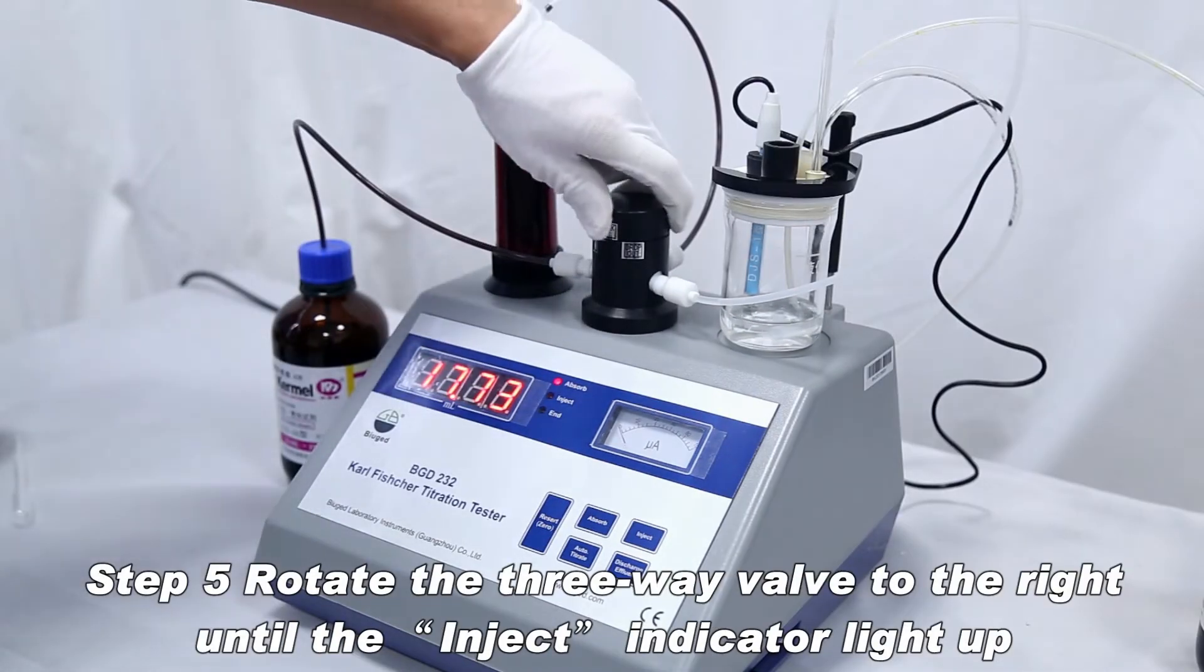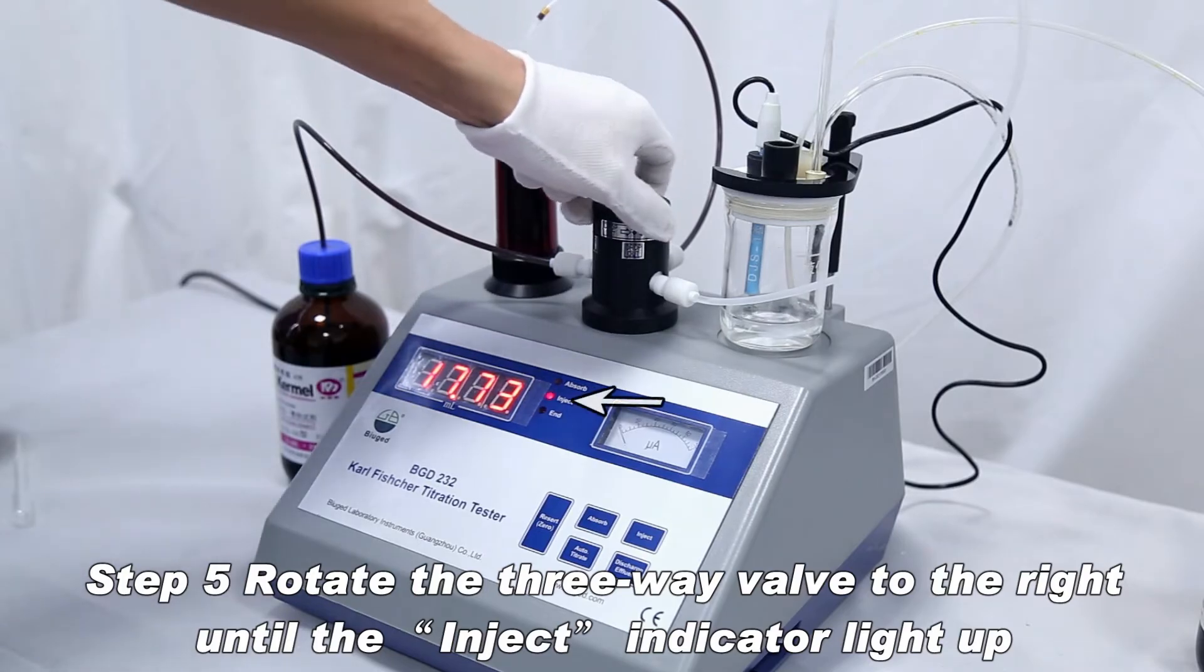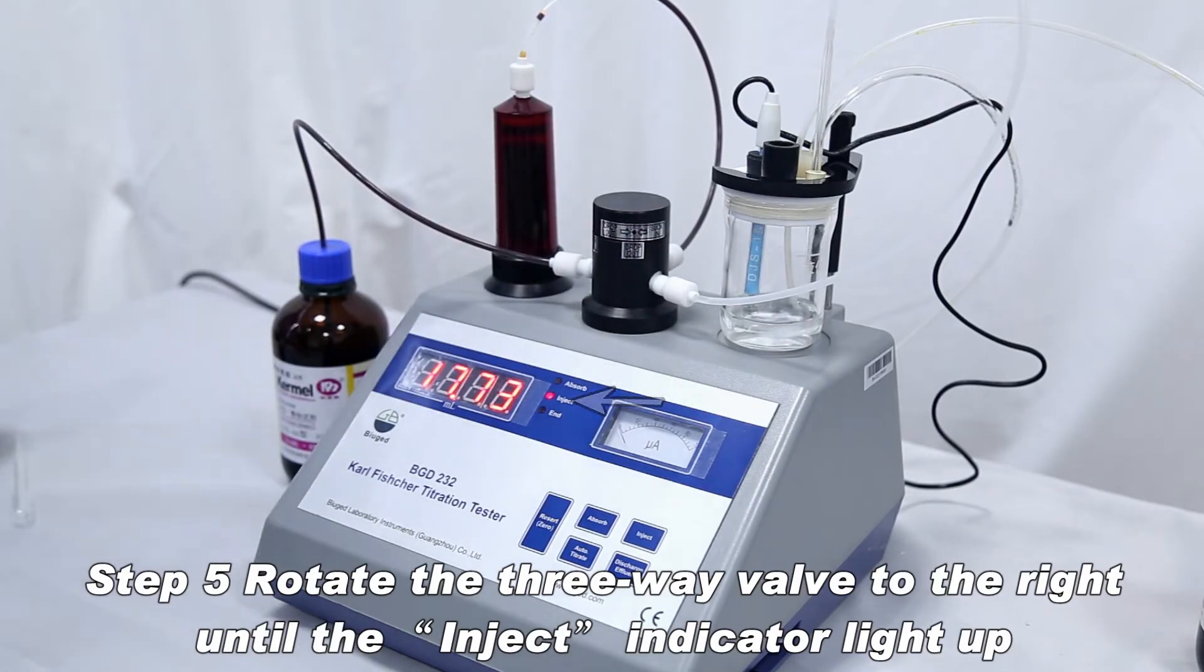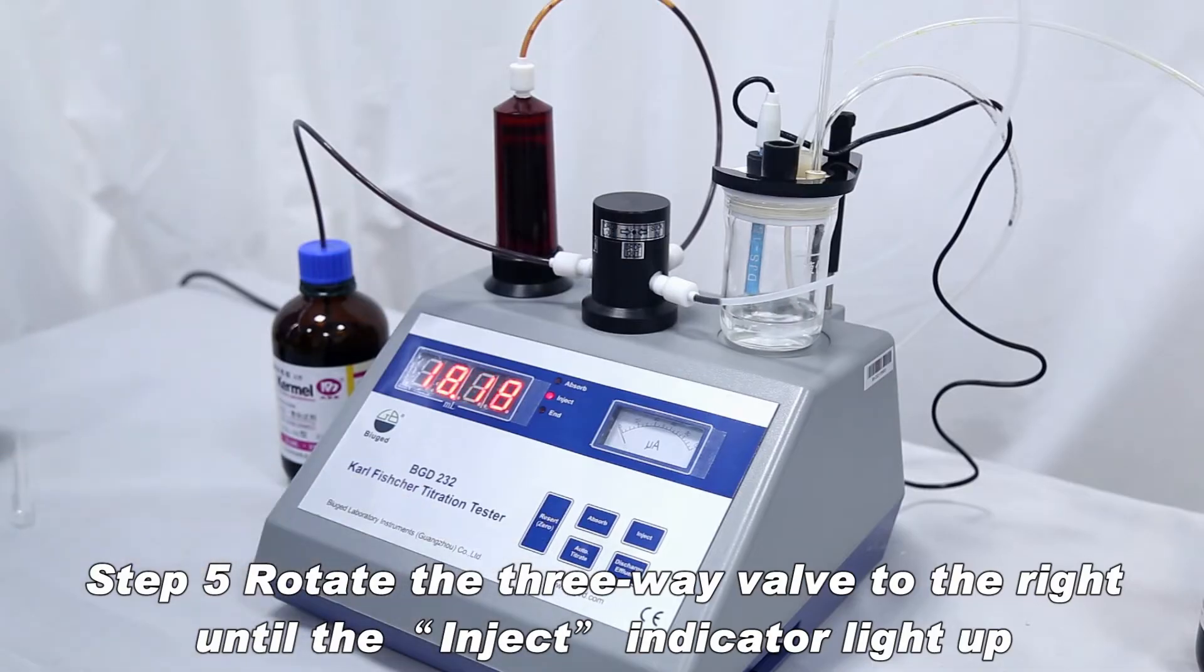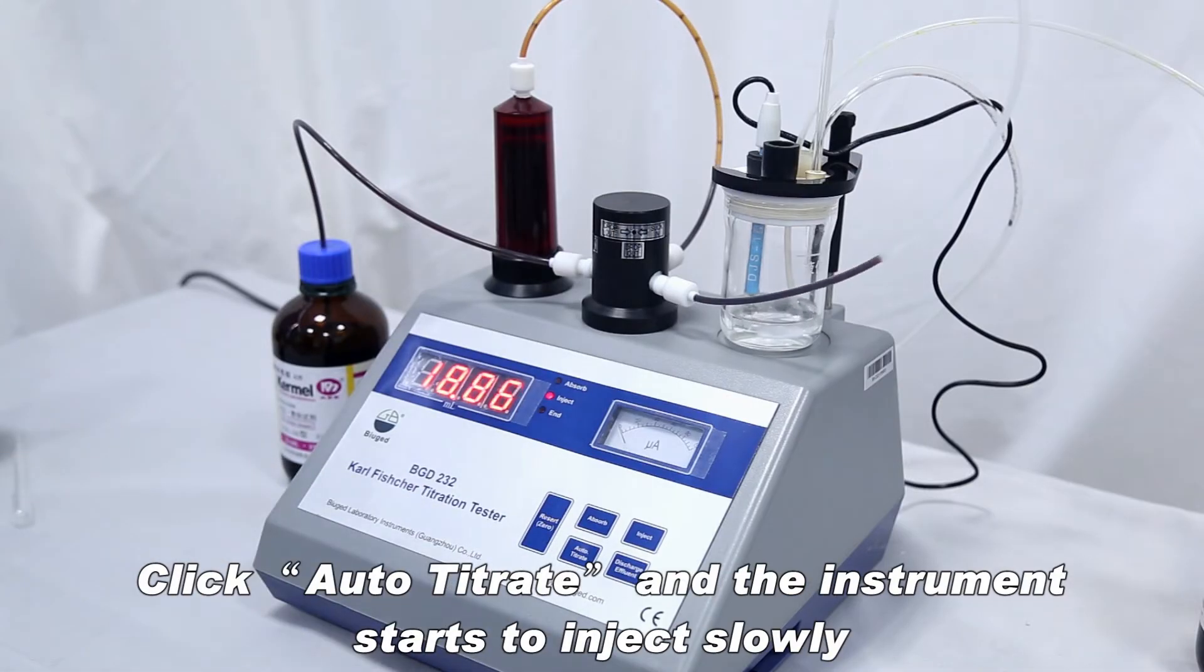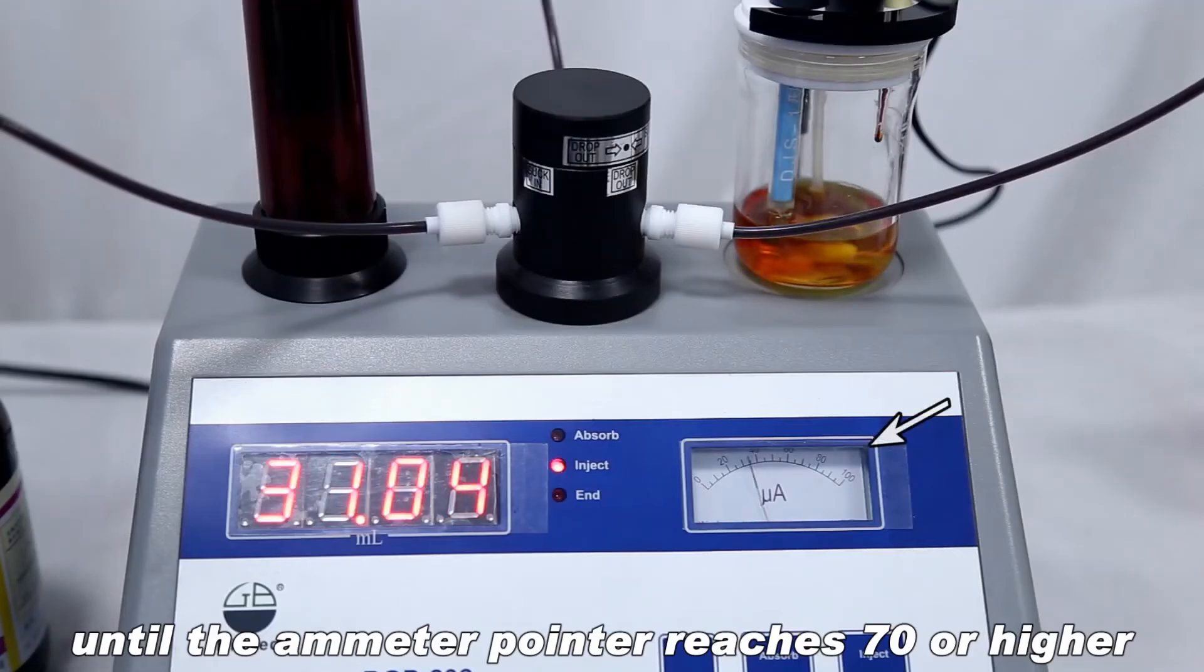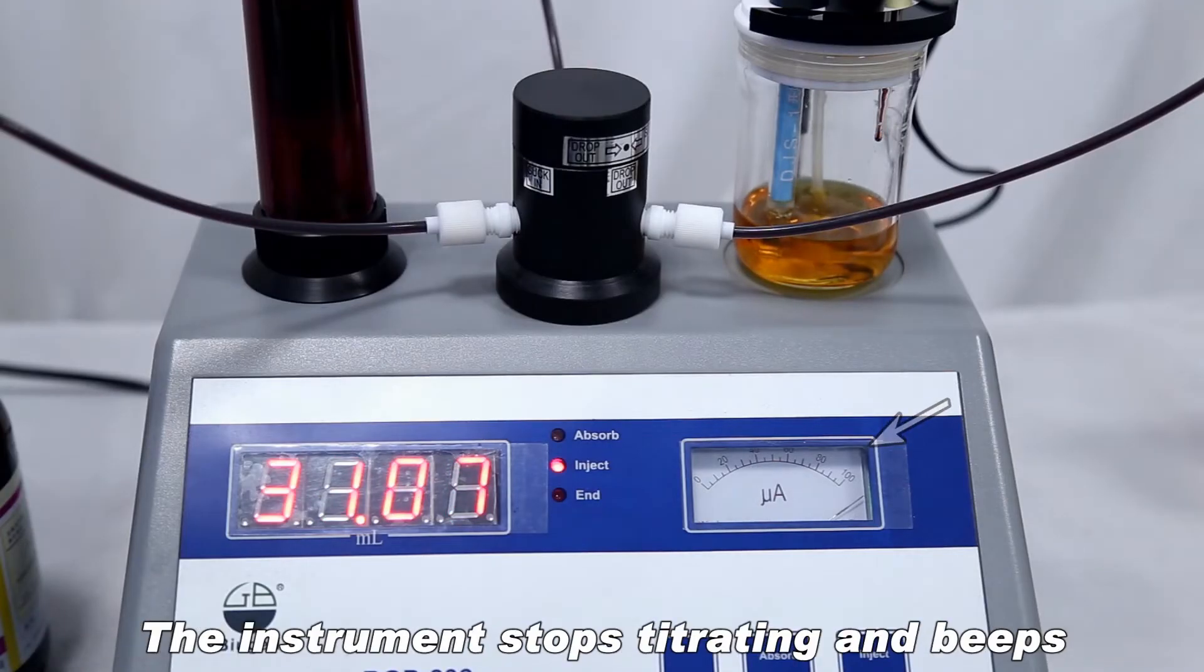Rotate the three-way valve to the right until the inject indicator lights up. Click auto-titrate and the instrument starts to inject slowly. Until the ammeter pointer reaches 70 or higher, the instrument stops titrating and beeps.